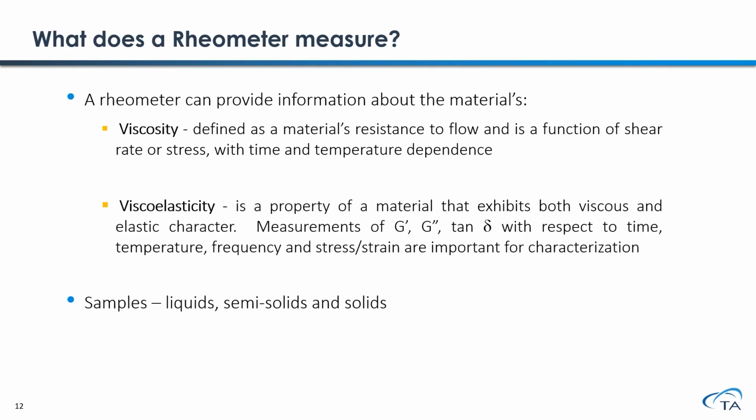It can measure those properties as a function of time, temperature, frequency, shear stress, and shear strain. The samples a rheometer can measure vary from very low viscosity liquids to semi-solids, soft gels, all the way to high stiffness, high modulus solids.